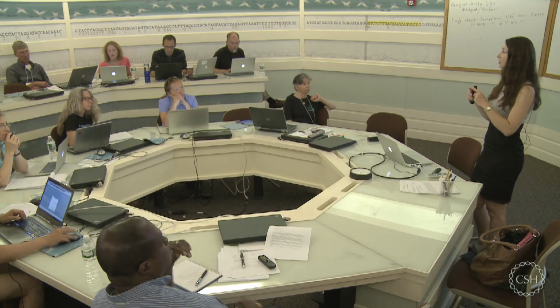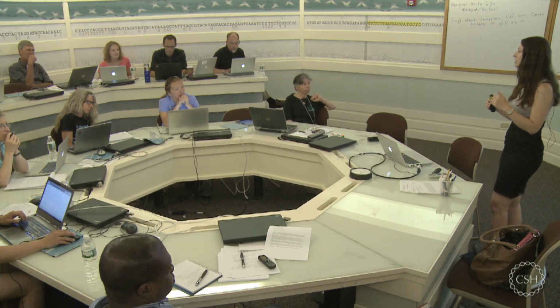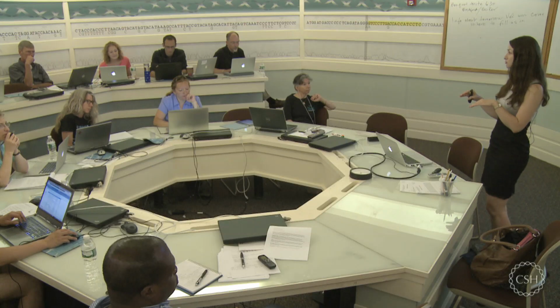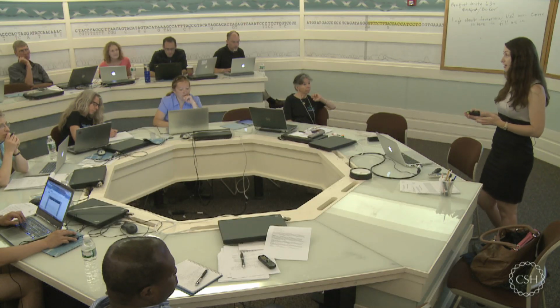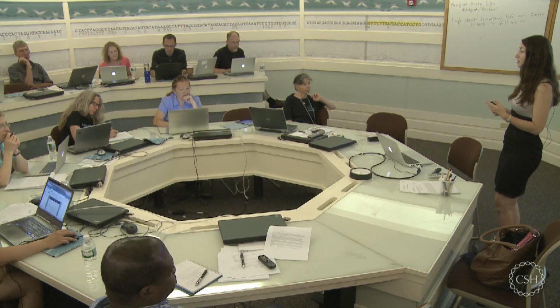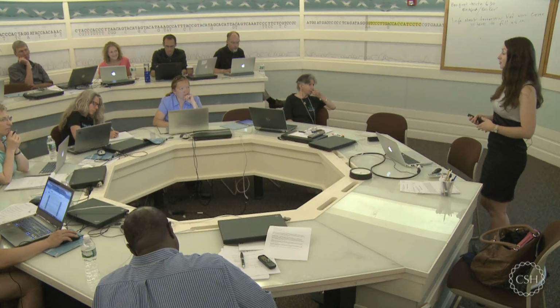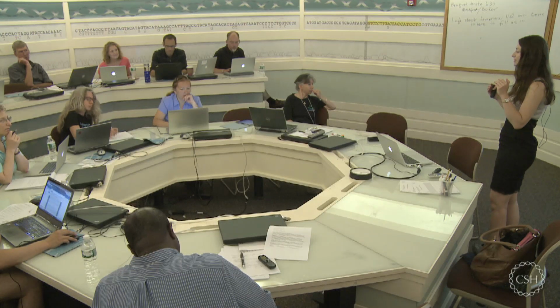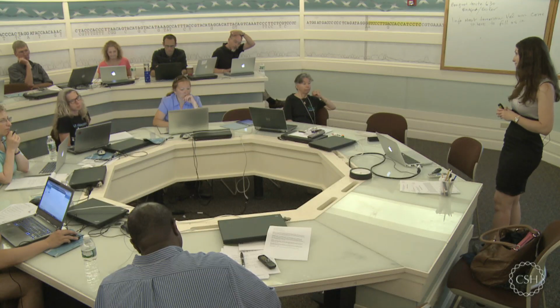And I actually check, okay, maybe there's a gap, so this is a good region to design my primers across. Or if there's really just a couple of SNPs, I design both forward and reverse primer on a SNP and try to have them as the last or second last base of my primer on the 3' end, because it still could amplify, and definitely in these cases you should probably use standard Sanger sequencing to verify what you're sequencing here, or use some other kind of verification of what you're amplifying. But it is helping in getting the right target sequence, at least in my experience.